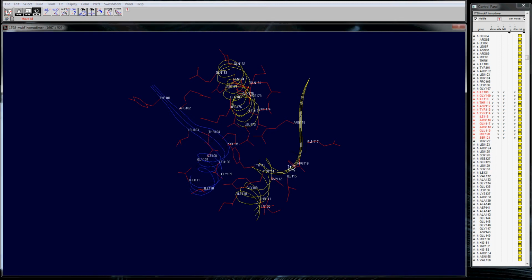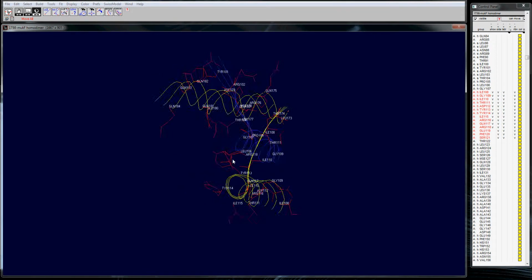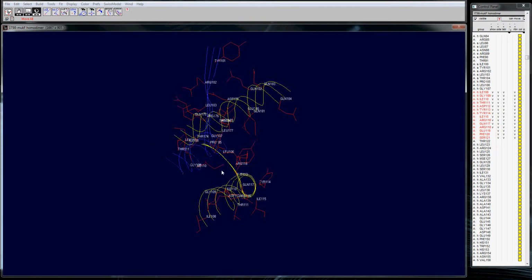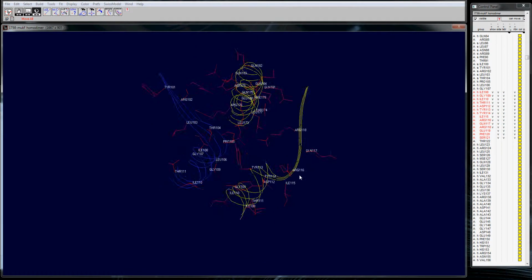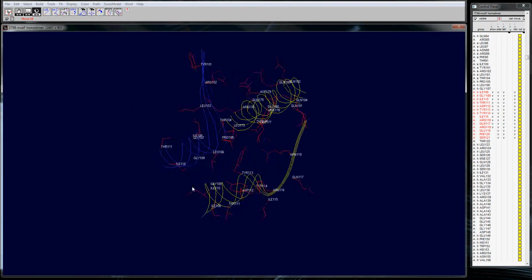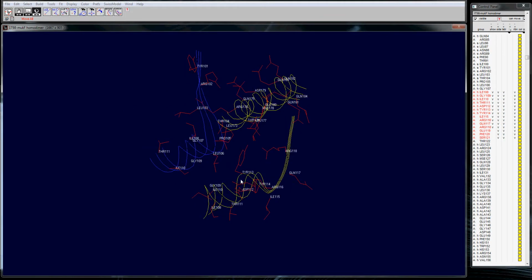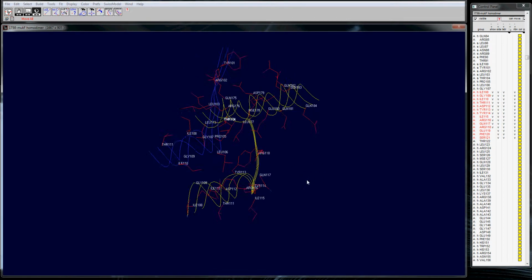Okay, we're back. So we left off looking at the region surrounding our tyrosine 113 here, and we just found the neighboring residues, and we were going to be thinning it down. So we're just kind of pruning away. So we've pruned away a couple from this chain. Let's just get rid of a few more.